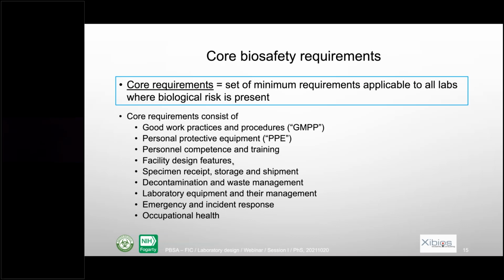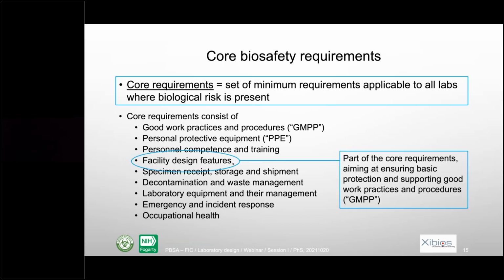So you see there are a number of core requirements. And if you look at this, you see that facility design is only part of that. And according to the WHO, it's not the main part. It's the part that should facilitate good work practices and procedures.